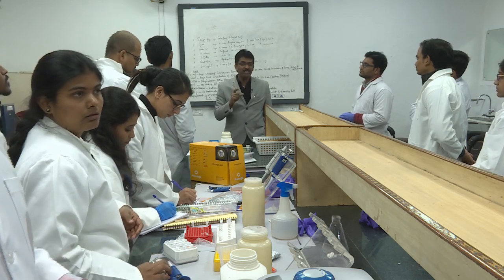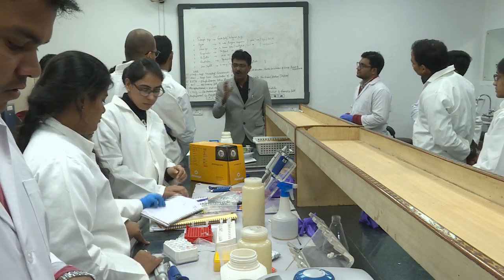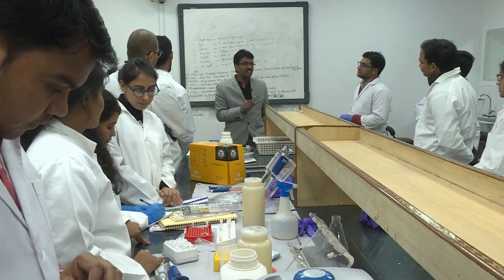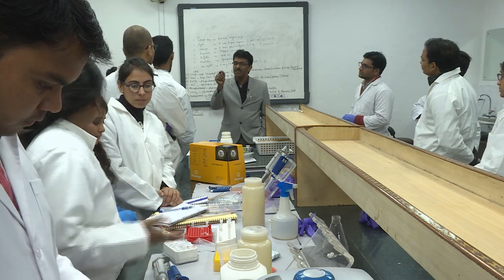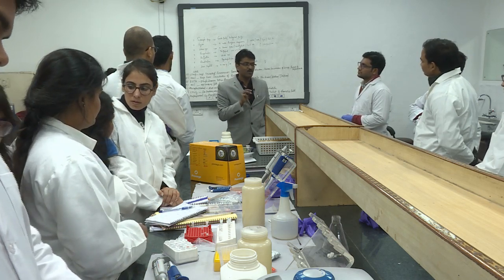Okay. Keep the glass powder at -20 for many days, just to avoid any dust coming in. Then whenever it is needed, you just take it out and add a pinch, there is no measured quantity, you only add a little pinch into the petri plate. With that machine, you get excellent results, there are no problems.